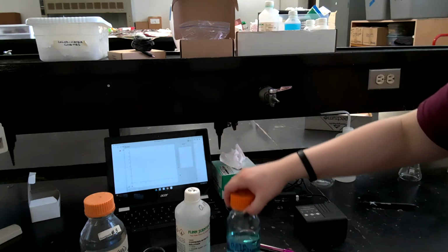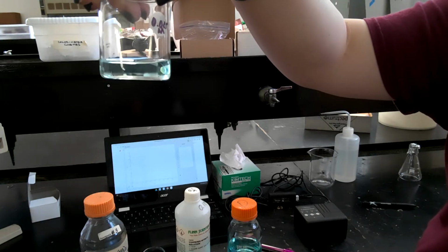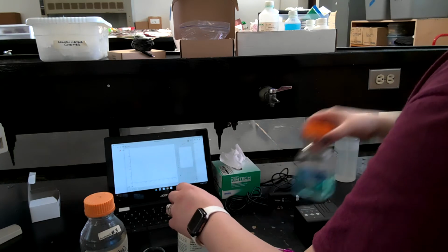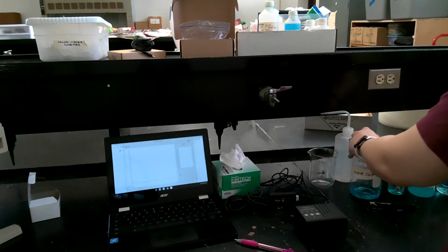And last but not least, here we have 0.025 molar of copper II nitrate. So take note of how the color changes from the first one all the way to the last one.